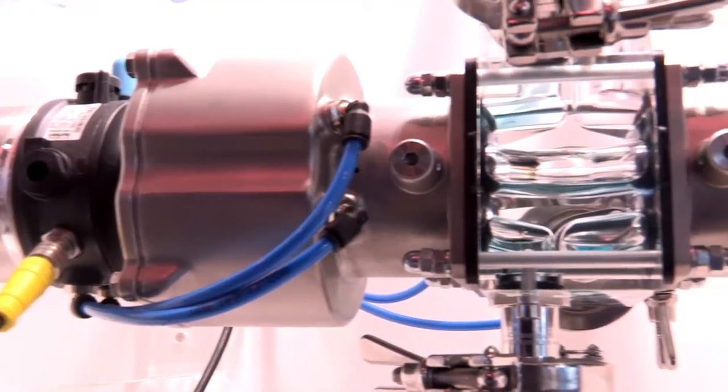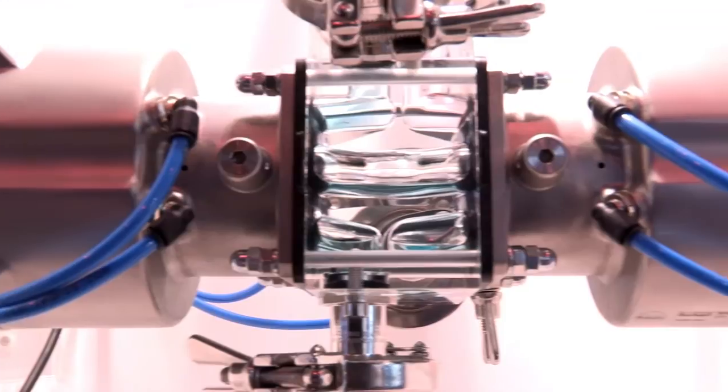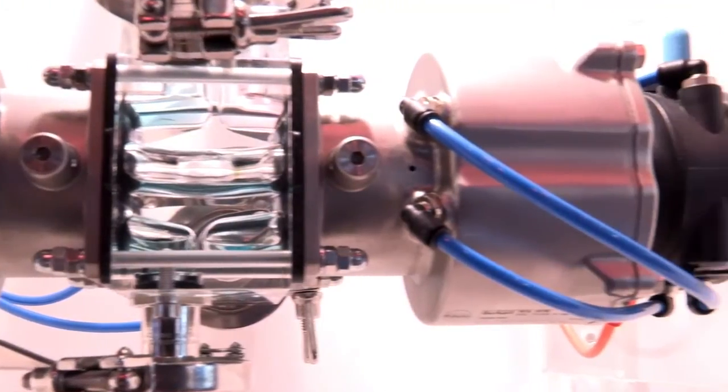The other thing is when you have a really good and smooth flow path, it's very much easier to clean. The cleanability of a block solution can improve the yield of the complete process.